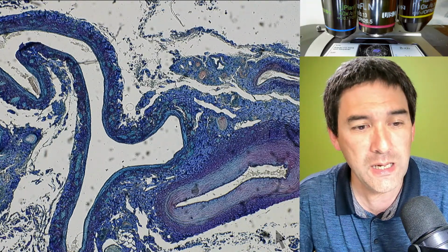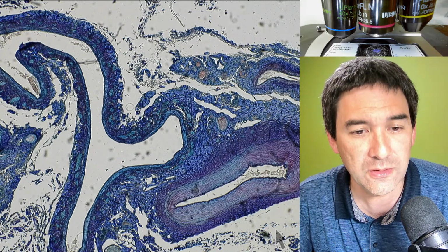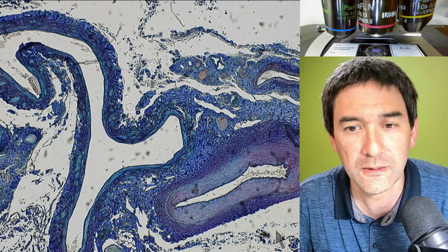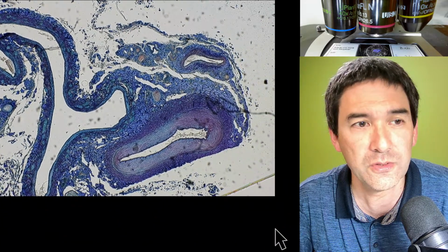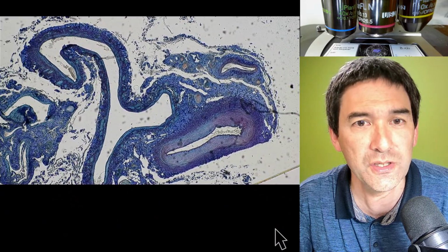If you want, I can actually illustrate this to you. Just a second to do it like this. The actual image that my microscope camera delivers is this.